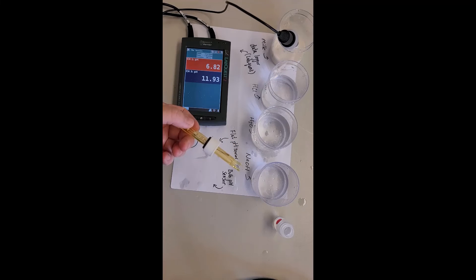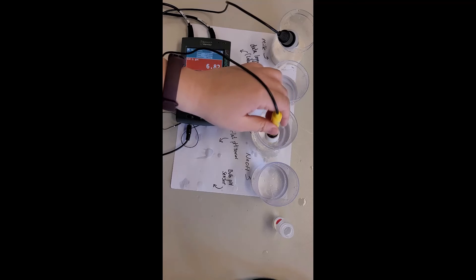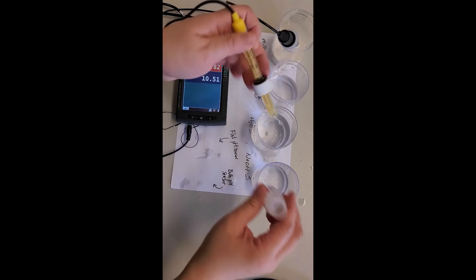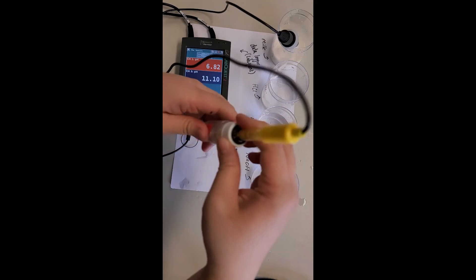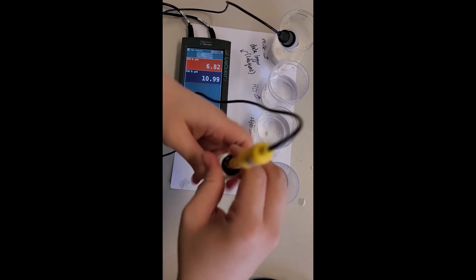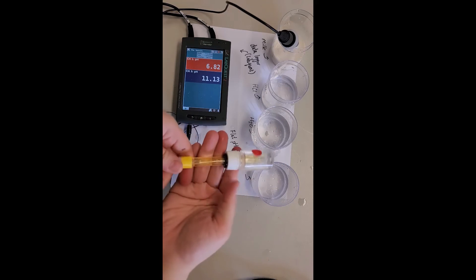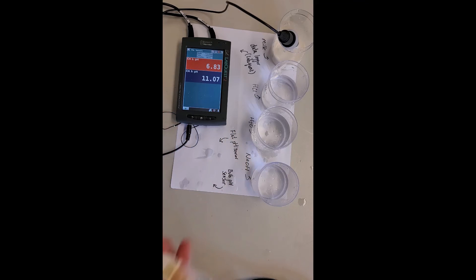Oh, just one more thing. Actually, how do we put it back? What we do is we usually rinse with water first. And then screw it, screw it in. So that's it. That's how you can return it to the trolley. Thank you and bye for now.